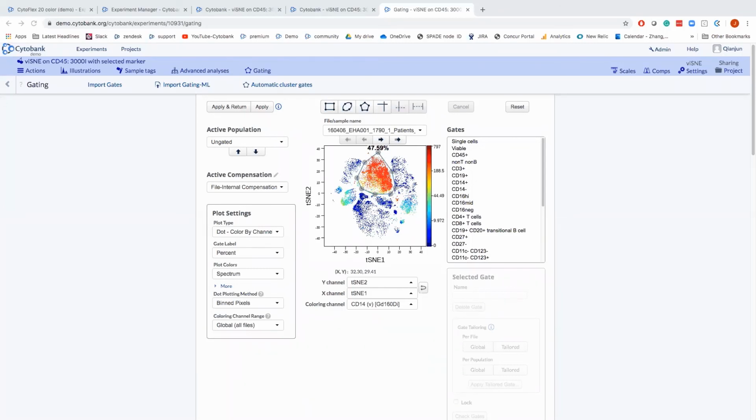So we would think, once it drops to the single digit, depending on the requirement of the viSNE resolution, if you're looking for some of the rare populations and tiny subsets, then you can run additional iterations. Otherwise, for major subset separation, once it drops to the single digit, you should be good enough. Perfect. Thank you very much.